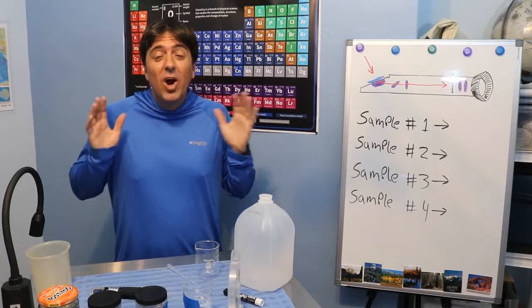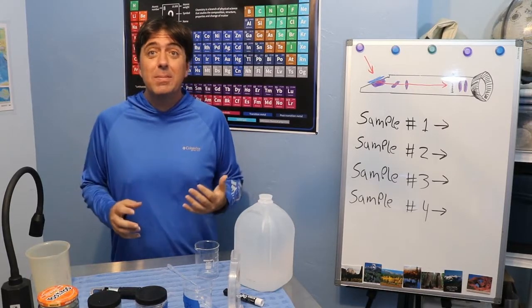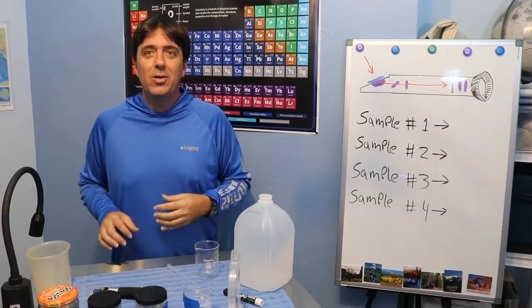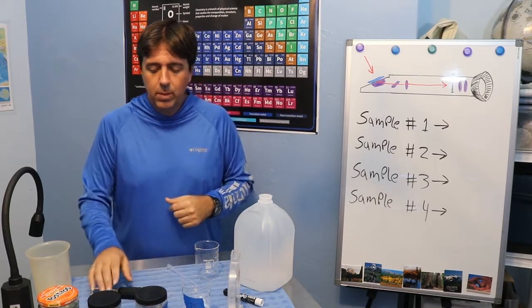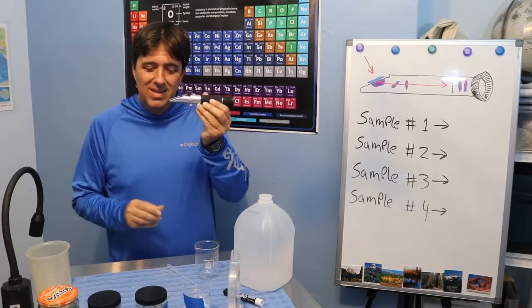All right, now we are ready to deal with the samples we collected. We are actually going to be processing 4 samples. The first 3 will be from the field, which you saw in the video, and the 4th one is from my 75-gallon tank here at school. But before we do that, we need to calibrate the instrument.